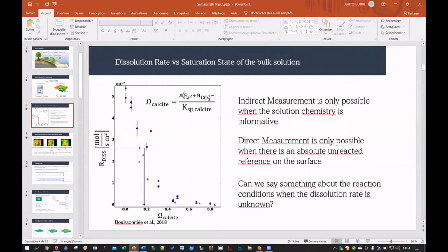Then the later question was about the biotic setup, and I guess we had some point of discussion. In the biotic setup, as you said, pH is not controlled because of the microbes themselves. Is it possible that the mechanism we showed about how the surface topography is affected by the microbes could be tested on another mineral surface, which is not that sensitive to the carbonate activity, just to study if there is an impact of the microbes?